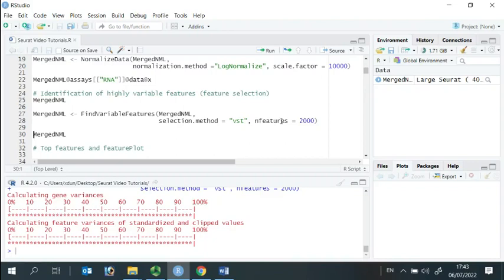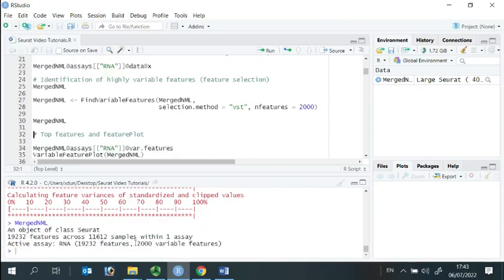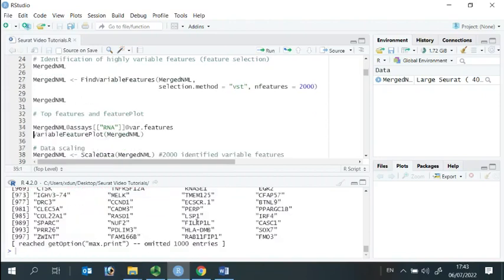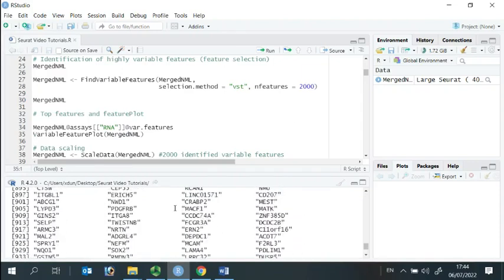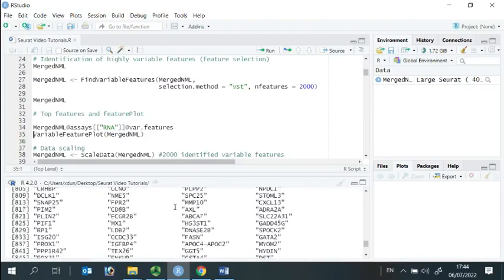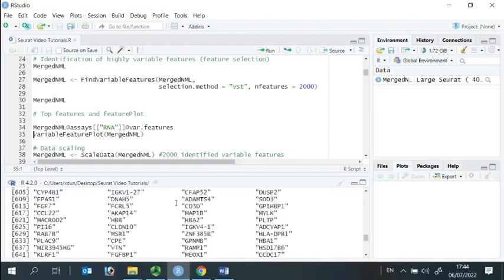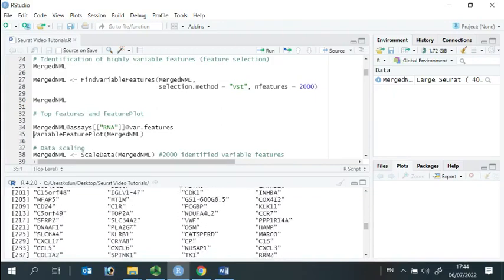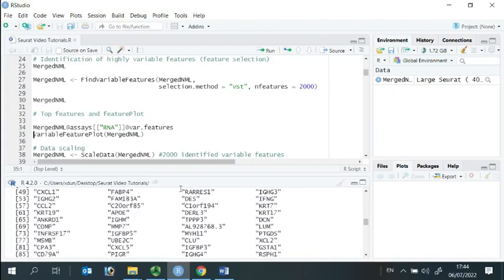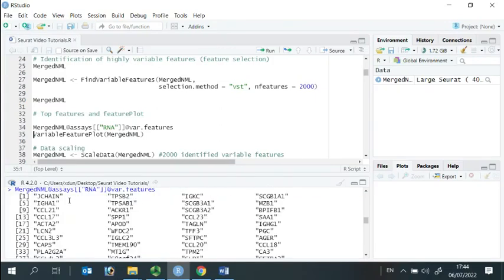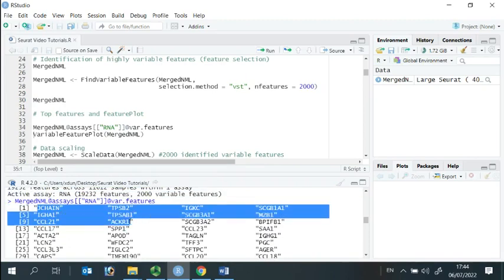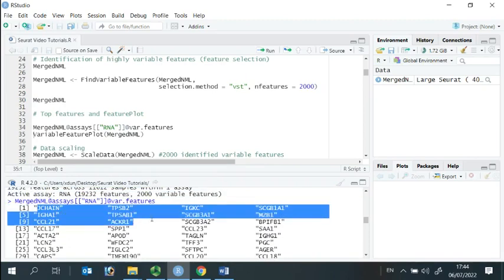Now, if you look at the data, we have 2,000 variable features. We can look at the variable features. You can see, we print out the first 1,000 variable features. And we scroll back to see the top 10 variable features.